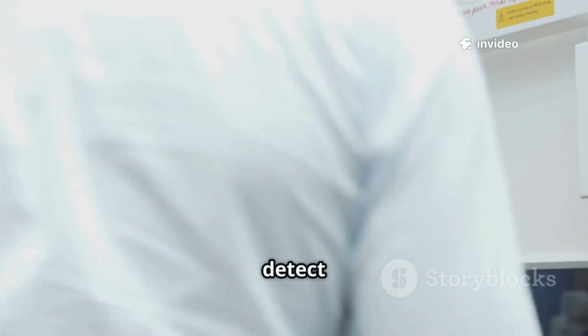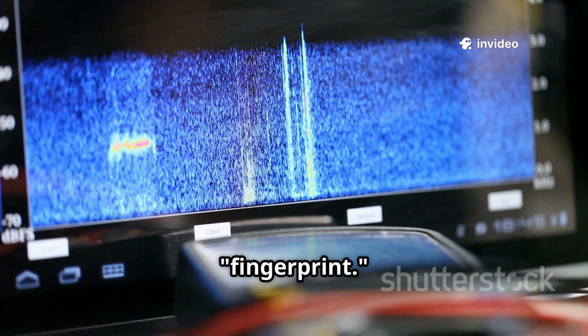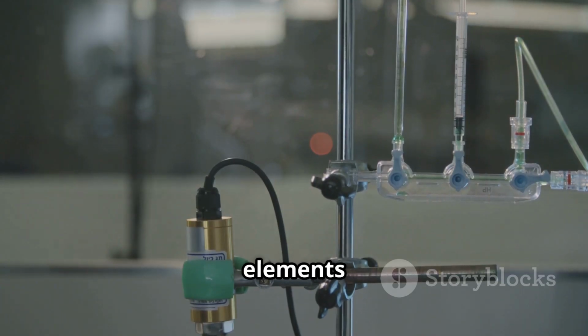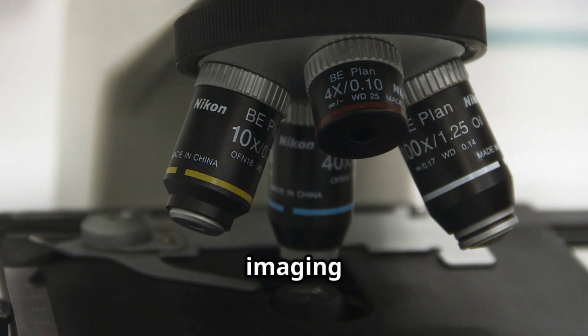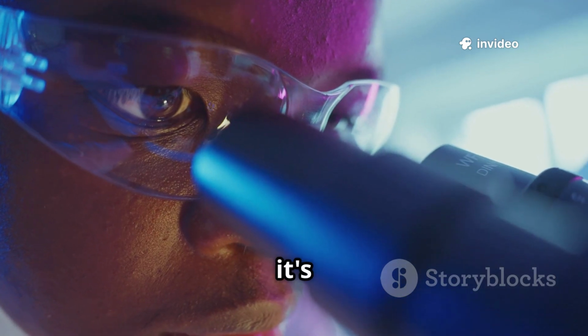The SEM can also detect X-rays emitted by the sample, each element producing a unique fingerprint. Using an EDX detector, scientists can map out which elements are present and where. This turns the SEM into a powerful tool for both imaging and chemical analysis. We don't just see the surface, we learn what it's made of.